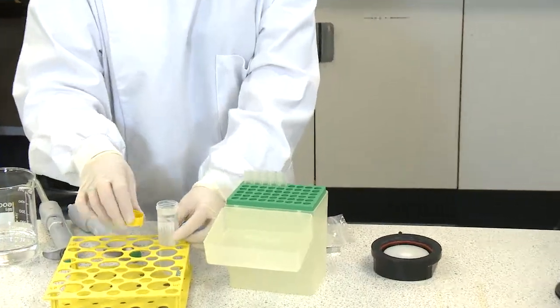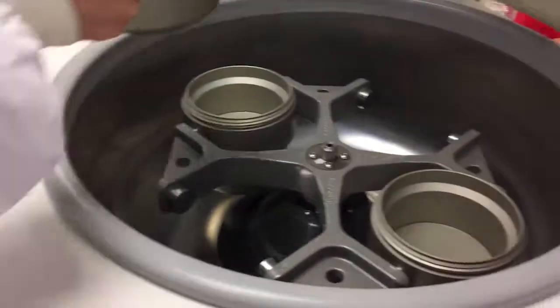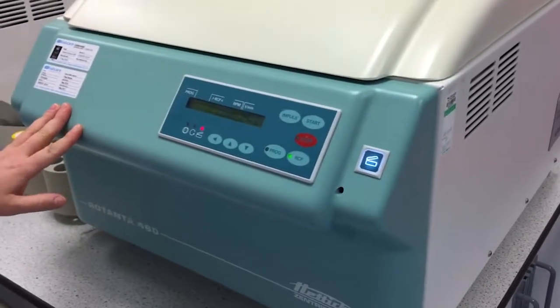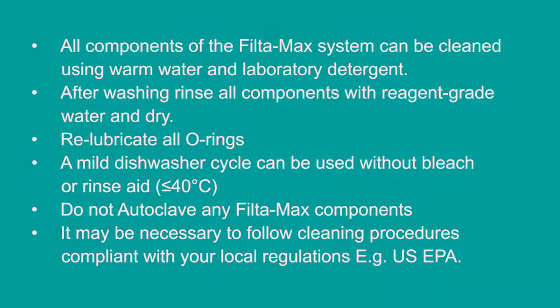Cap the tube containing the concentrated eluate. The 50 milliliter centrifuge tube can now be centrifuged. After use, it's recommended that equipment should be cleaned using warm water and detergent.